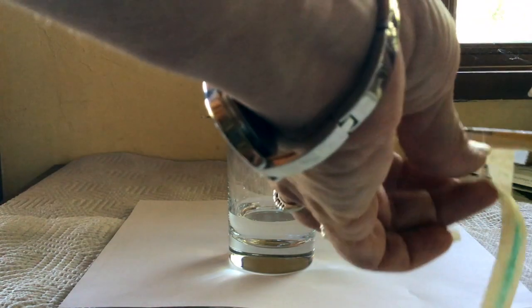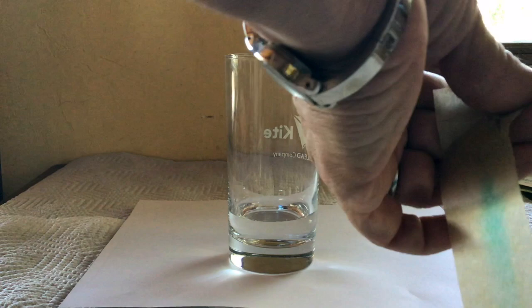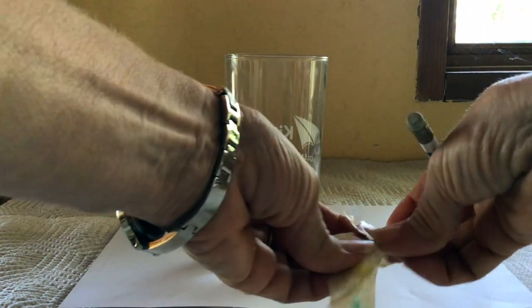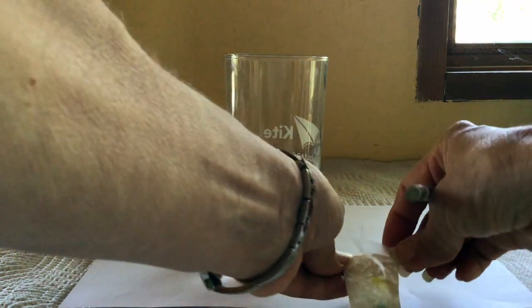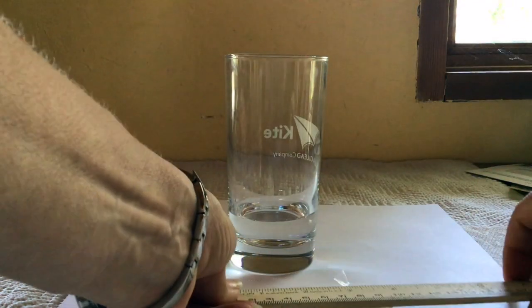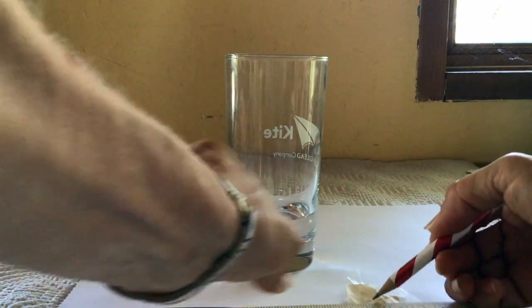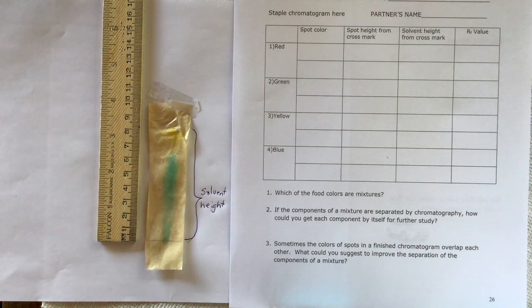If you take it out early, you can create a new pencil line by drawing a line as far as the water traveled. The water went just about here, so I'm drawing a new pencil line slightly lower than the original one. Our green food coloring has separated into blue and yellow dyes — so we do have a mixture with the green. You'll find out for red, yellow, and blue what yours separates into.